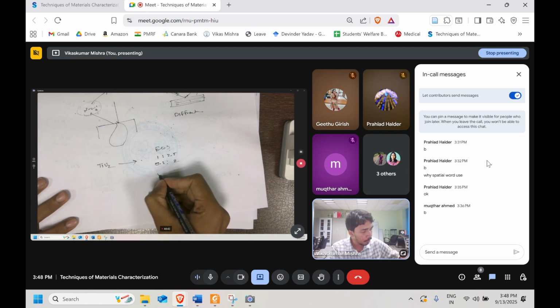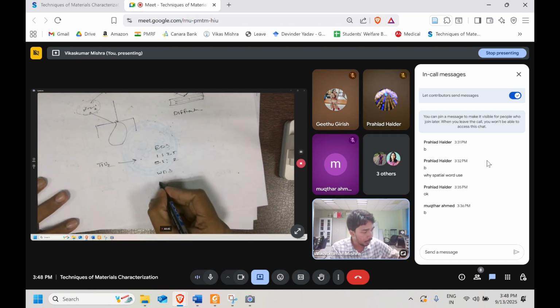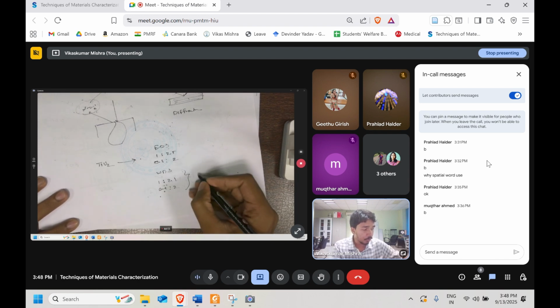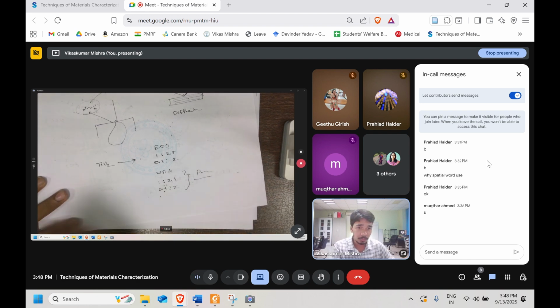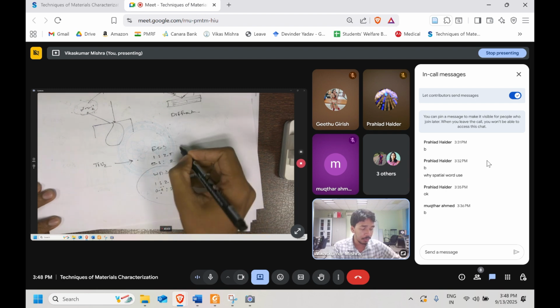While if I do the WDS, the ratio which you get will be very close to it, 1:2.1, or we can say 0.9 to 2, and so forth. So this is giving more precision. The compositional information you can get from this in better resolution compared to the EDS.